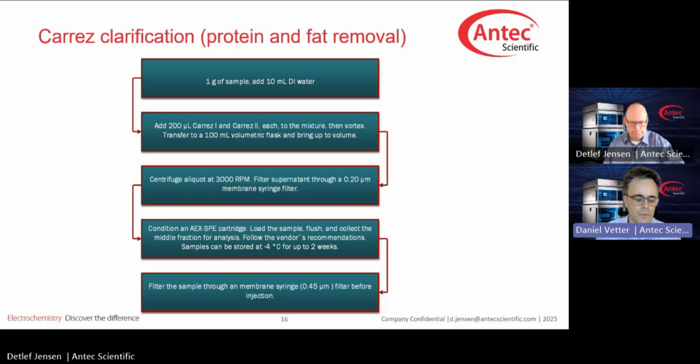And I believe the reason to be the sample matrix, but maybe it was just the sample prep. Yeah, with the sample prep where we are adding anions, we are basically changing the matrix of the sample to be analyzed. That is one of the reasons why I prefer sample preparation techniques without adding components to the sample, because then we are circumventing these sad issues.